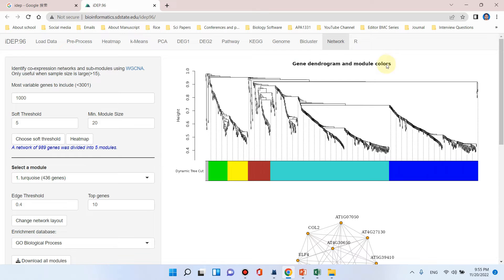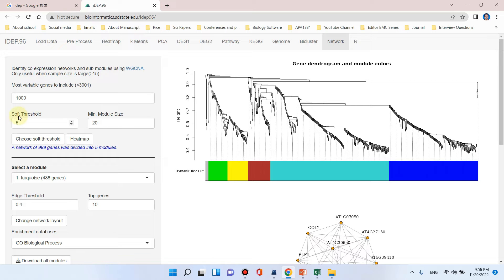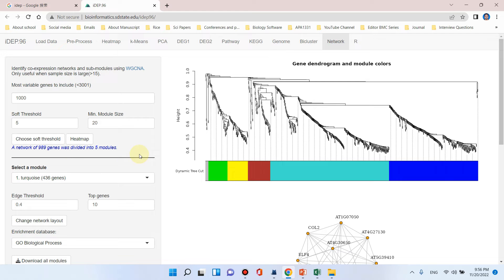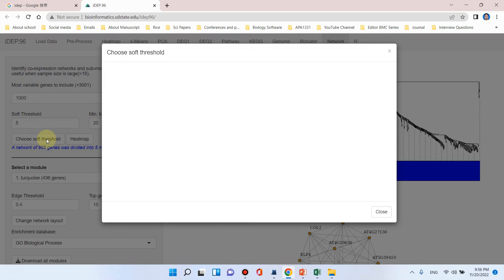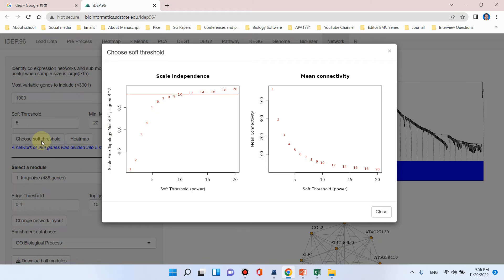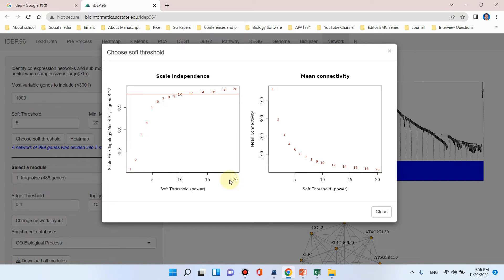It is now constructing the gene expression network. You can see here gene dendrogram and module colors have appeared. It is important to note that in different papers some people are using soft threshold of 5, some people are using soft threshold of 10. So how can we choose our soft threshold? For this we can simply click here. You can see here the scale free topology model fit.